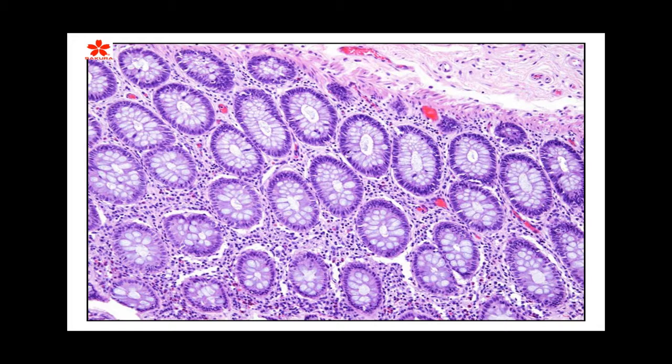So what we have to do as scientists, preparing the slides for them, is condition ourselves or train ourselves to take a critical look at the tissues. We don't want to just look at the nuclei and see blue. Well, it's staining blue. Okay. We really want to look for crisp nuclear detail in the chromatin material, and so that gives us an example of whether this is a sharp nuclear stain or not. We also want to look at the contrasting counterstain that we see in the slide. So this gives us a way to critique a slide rather than saying whether it's blue or pink.